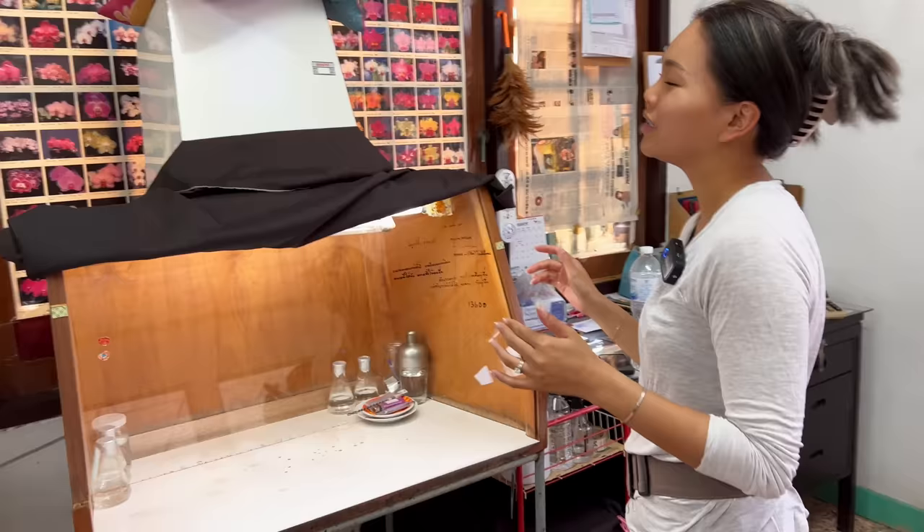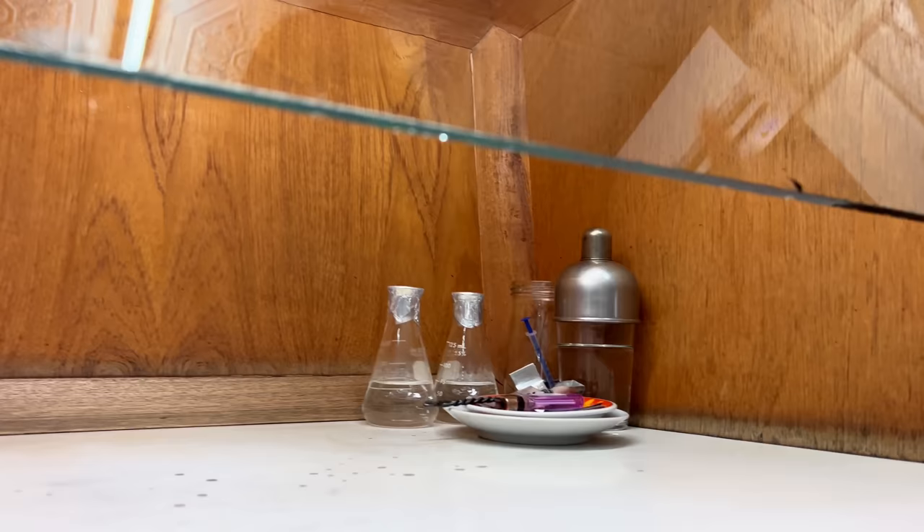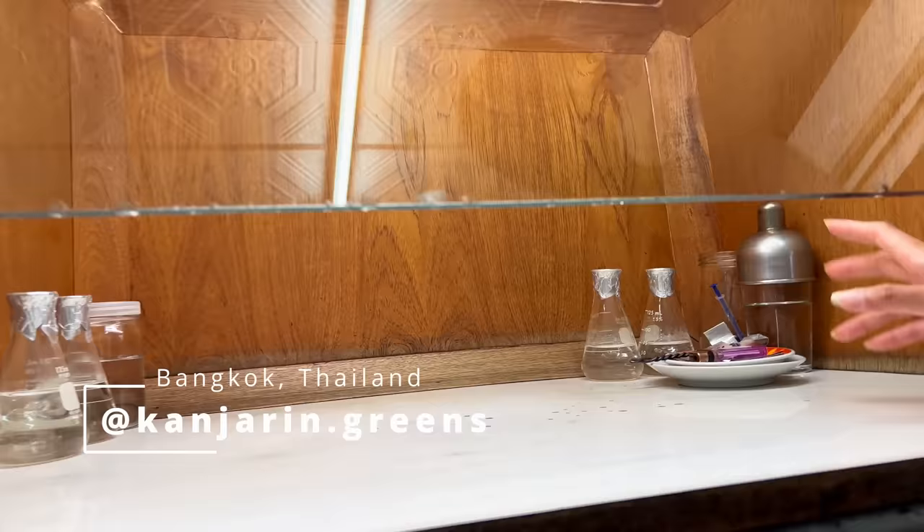I don't want to say old school, but it's like the original setup for tissue culture. So there's a fan up in here. Anything in here needs to be cleaned, sterilized — there's all the alcohols and everything. So each piece of equipment that goes in here, we have to clean it.